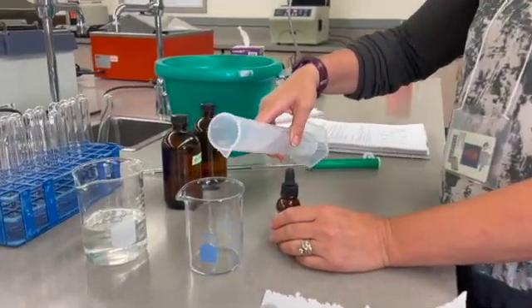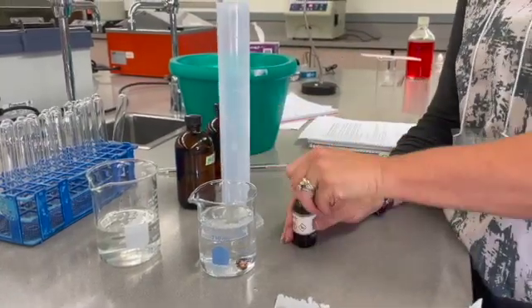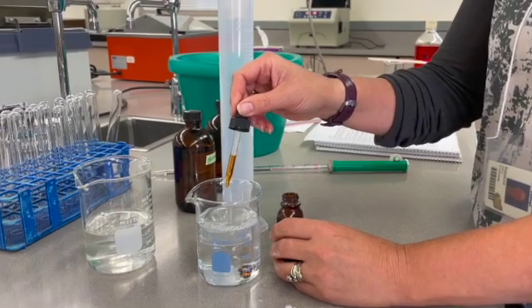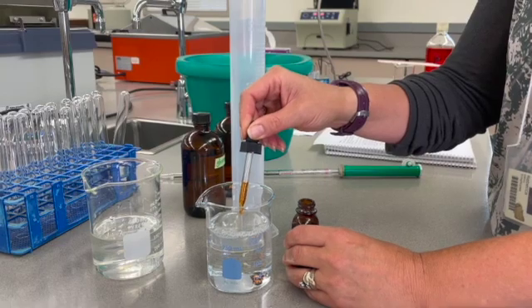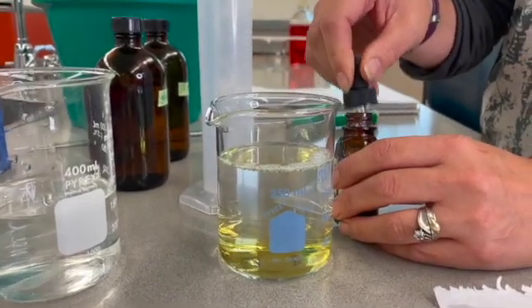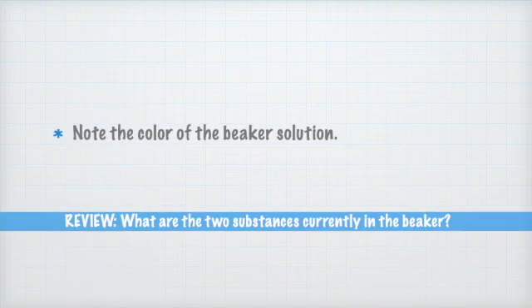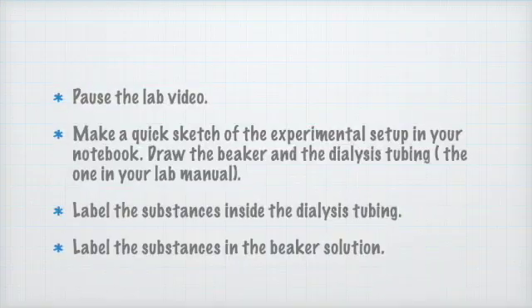Now we measure out 200 milliliters of water, add it to a beaker, and then add approximately 20 drops of Lugol's iodine to the water. We now submerge the dialysis tubing in the beaker solution.